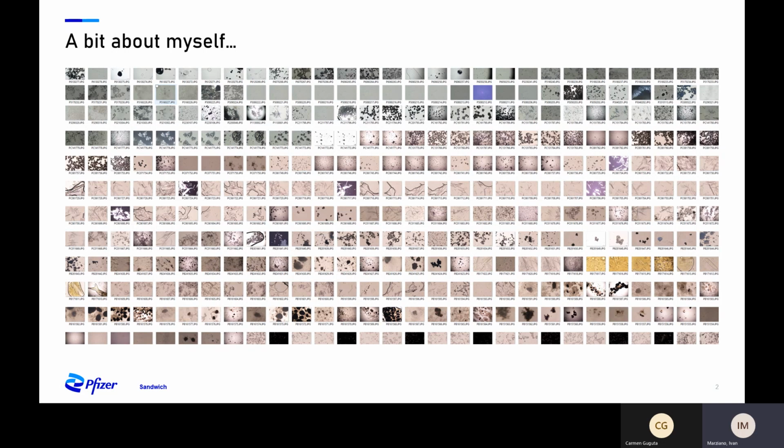You can have a little flavor of the sort of things that I've encountered on this slide, and you can see there's pretty much a spectrum of different crystals, from nasty agglomerates to needle-like particles to nice well-formed cubes. So to me this reiterates the importance of having the right tools for crystallization development.